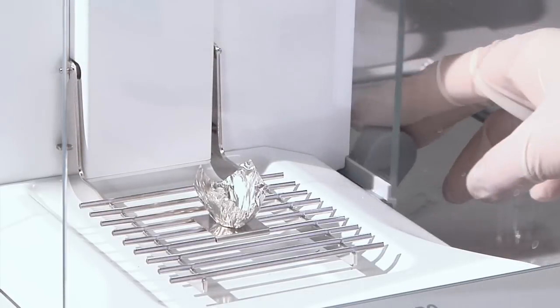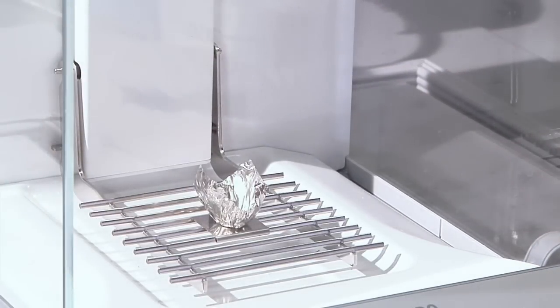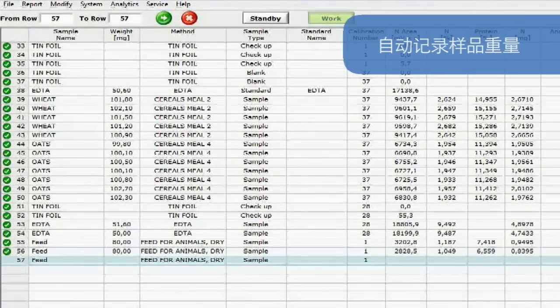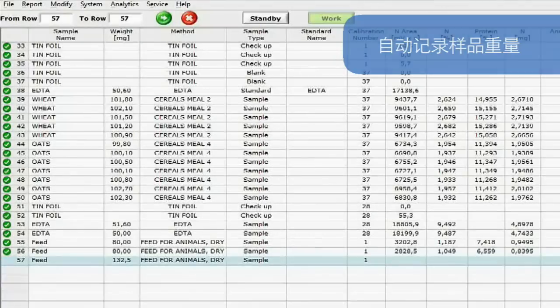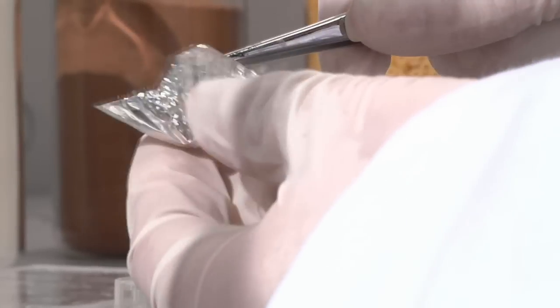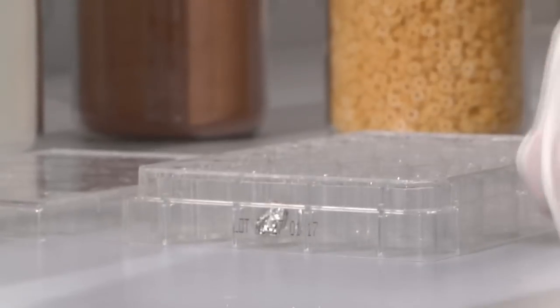The homogenized sample is weighed in a tin foil capsule. The sample weight is automatically transferred to the dedicated Dumasoft software for increased convenience. Dedicated accessories simplify the sample preparation and are ideal to improve the flexibility of the instrument.